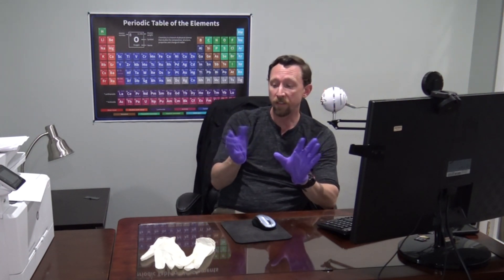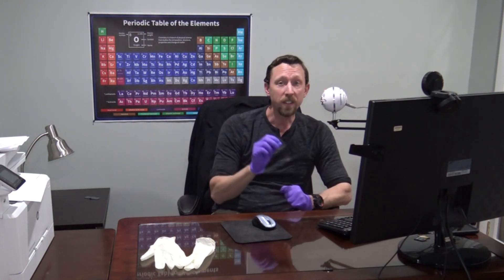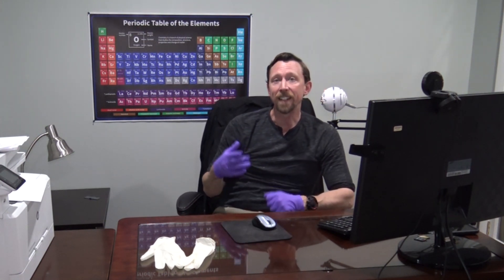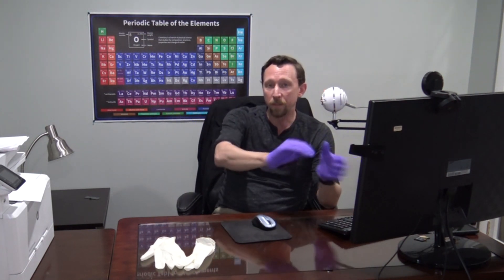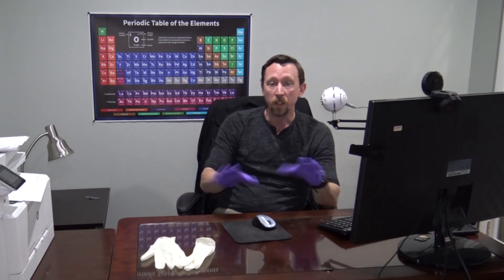These gloves are disposable — they're very inexpensive and disposable for a reason. You don't want to wear them for extended periods of time while performing multiple tasks in different places. If the gloves get contaminated and then you walk into another room and perform another task, you run the risk of moving that contaminant into the other room and spreading it around. So even if you've got these gloves, you have to be careful to de-glove often and re-glove when you're out and about.